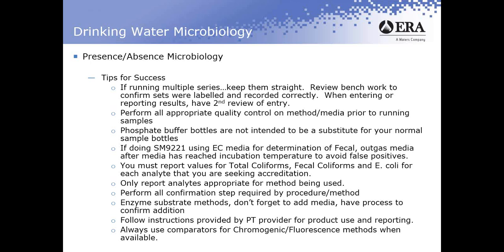A lot of manufacturers that make that media will actually tell you, after it's been in the incubator for an hour or two, to go back and get any gas that's formed out and then place them back in the incubator and continue the test. If the target organism is present, you're going to see that production through the rest of the test. So I would recommend that.